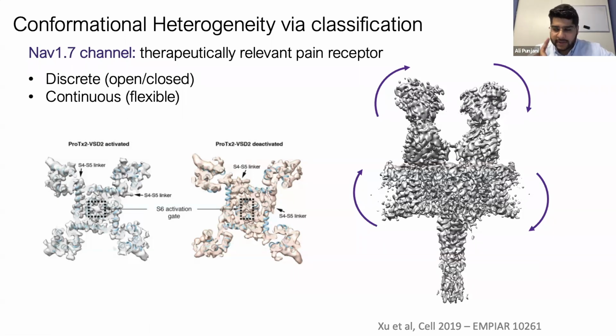No, actually, no, you're right. Sorry, it doesn't require a volume input. Labeled as mask. Yeah, it requires the particles input and a mask input.